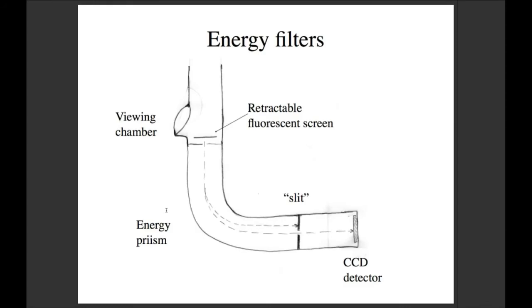Energy filters. So this is where it gets a little bit more fun. So energy filters are, and I'm only going to go over the post-column ones, because I'm not actually even sure of any in-column energy filters that I've experienced. No, there are Omega filters. So we used to have a microscope called the JEOL. It was an in-column energy filter, and I think that's a secure type of energy filter.